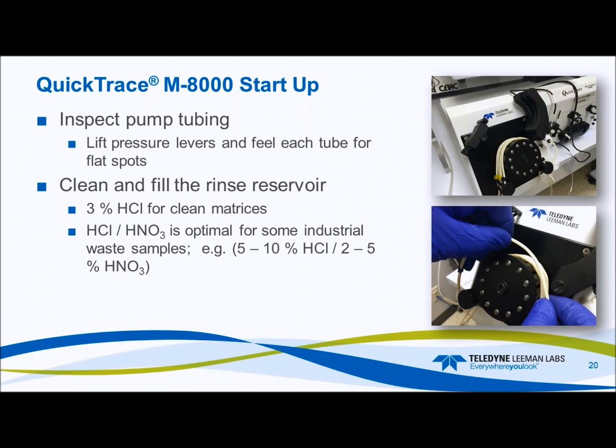So enough about that. So the 3% rinse, typically we run 3% HCl for clean matrices.